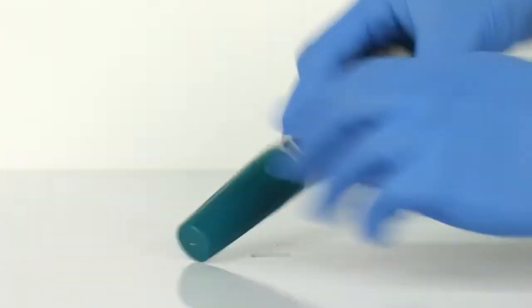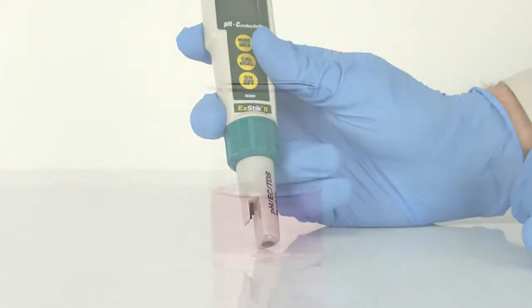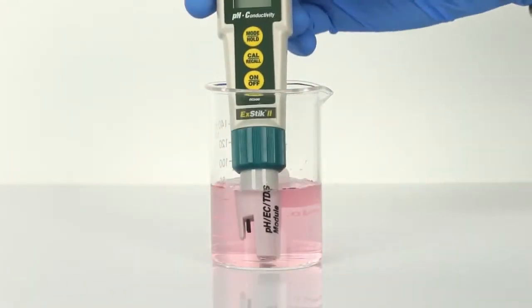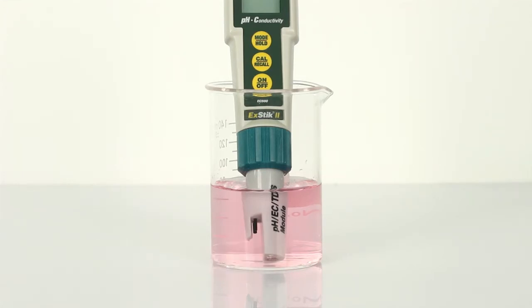Remove the cap from the bottom of the XTIC to expose the electrodes. Before the first use or after storage, soak the electrode in pH 4 buffer solution for about 10 minutes. White potassium chloride crystals may be present in the cap or on the electrode, depending on the length of time in storage. These crystals will dissolve while soaking the electrode, or they can be rinsed away with tap water or distilled water.